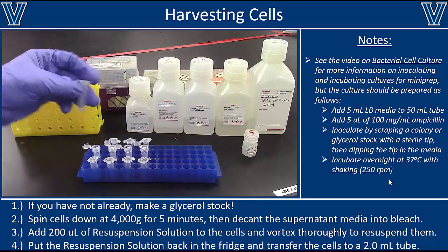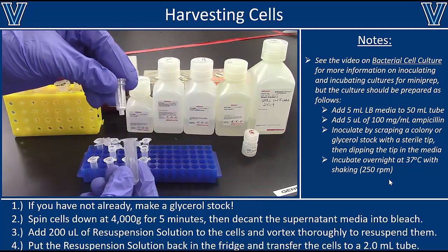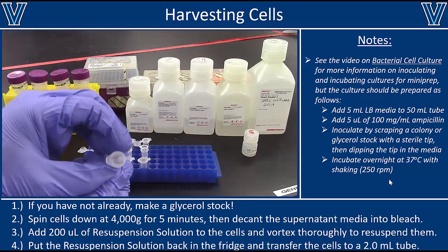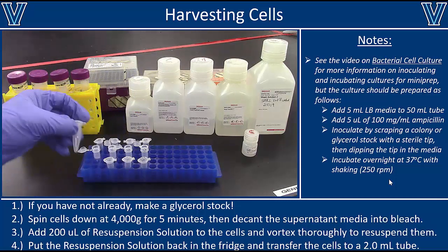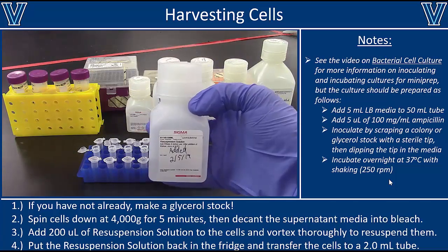We've got some tubes here that we're going to use for lysis, a spin column, and a collection tube for the purification stages, and then some highly detailed labels on some Eppendorf tubes, because those are the samples, that's where the sample's going to end up. So we want to make sure we got some good labels there.